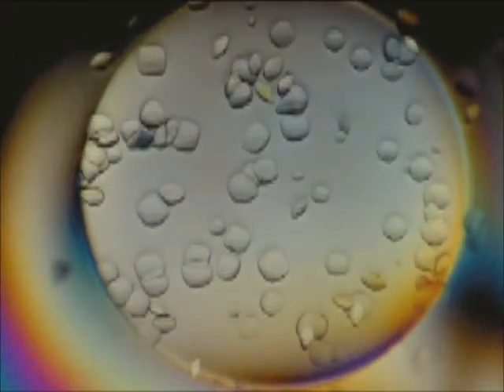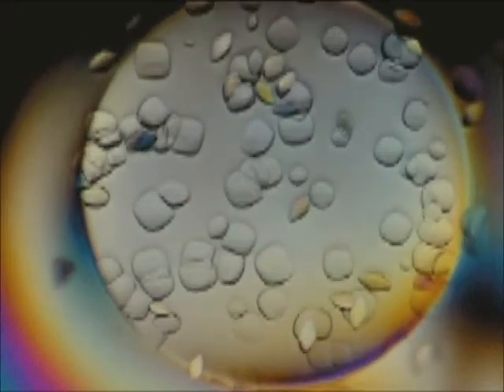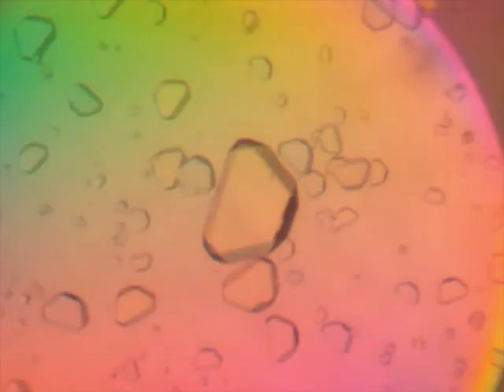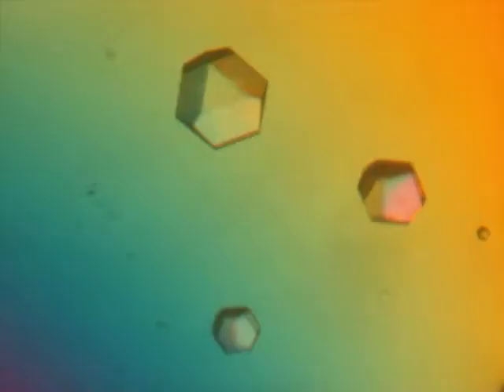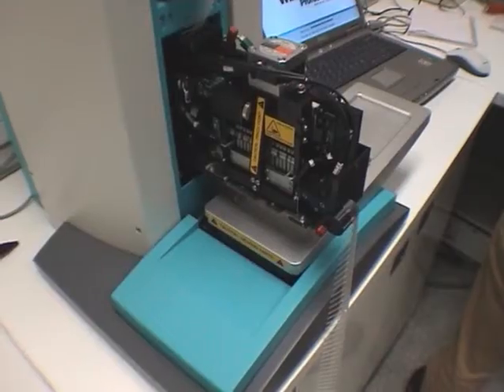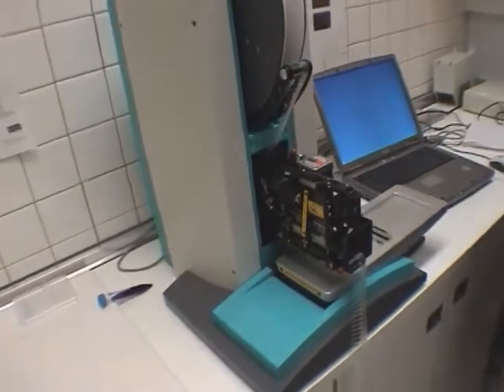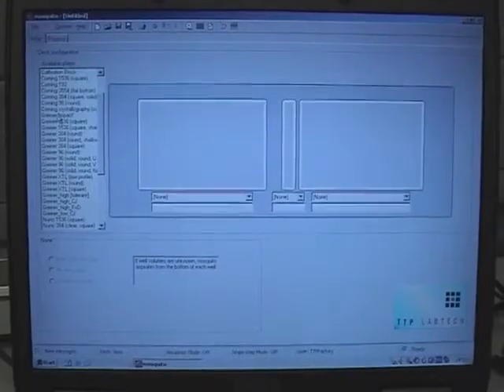Each molecule studied is unique, and it is impossible to predict in advance the conditions necessary for its crystallization. Determining the right conditions involves screening many test solutions of very different compositions. The use of a robot allows many more tests to be done by dividing by 10, if not 100, the quantity of material needed for each test.